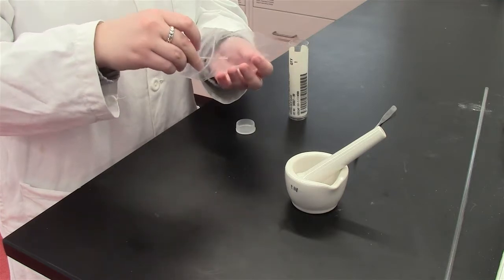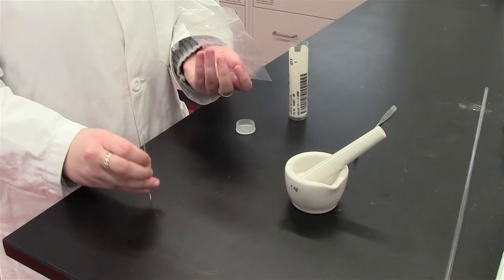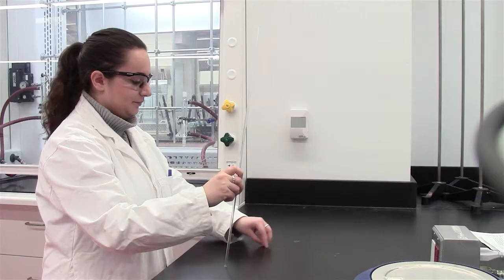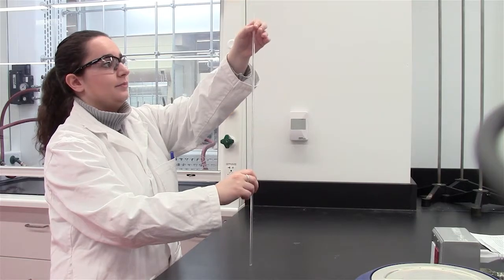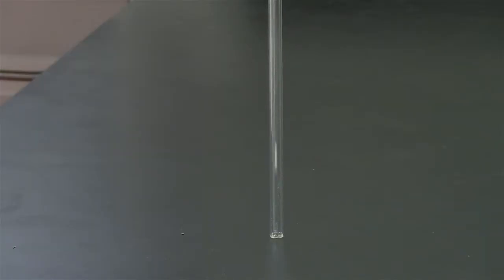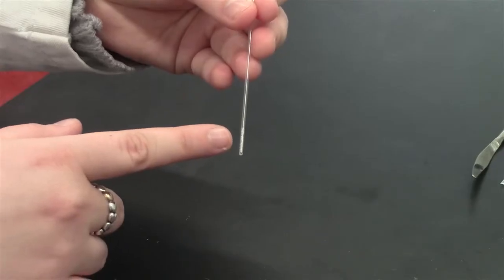To lower the substance to the bottom of the tube, either tap the capillary tube vigorously on the bench top or drop the tube into a long clear plastic tube and allow it to bounce on the bench top. Ensure that there is approximately 3 mm of sample within the tube.